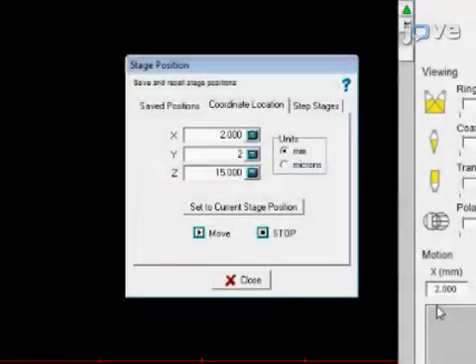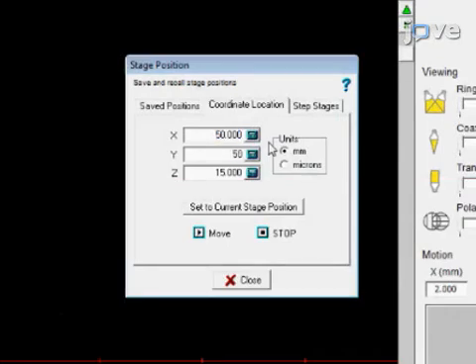For a two-volume ablation cell, every 10 minutes, move the sample stage to each corner of the chamber to reduce the amount of residual air in the cell.